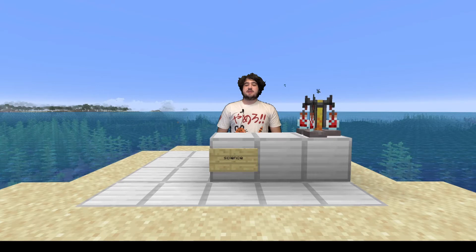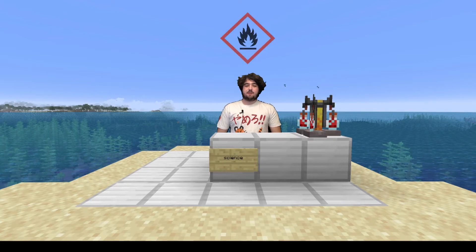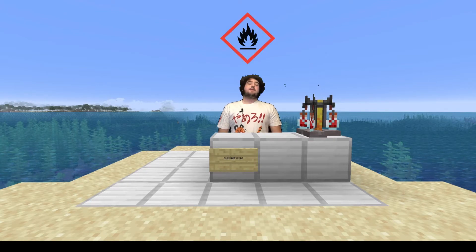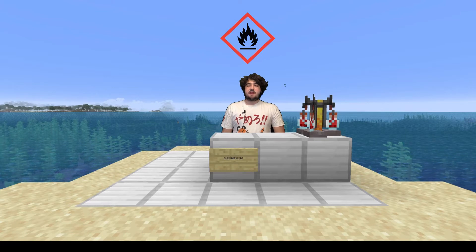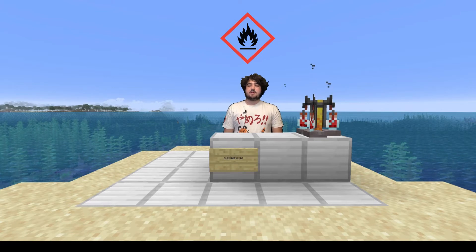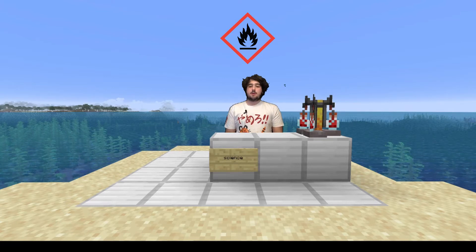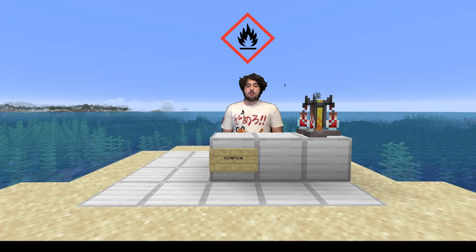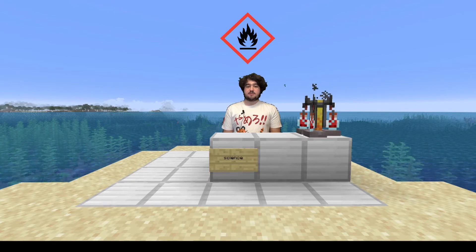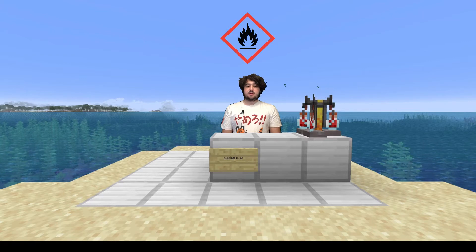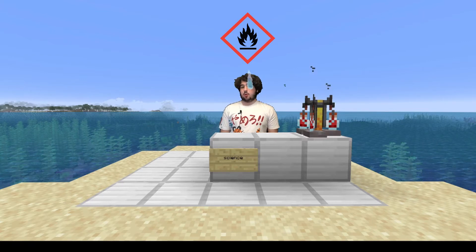The first safety symbol we will look at is the flammability symbol. The flammability symbol represents the fact that the chemical is easily flammable, as the name implies. Chemicals marked as flammable should be kept away from heat, sparks, or open flames. When handling a flammable chemical, it's good to wear eye protection just to be sure — you never know.